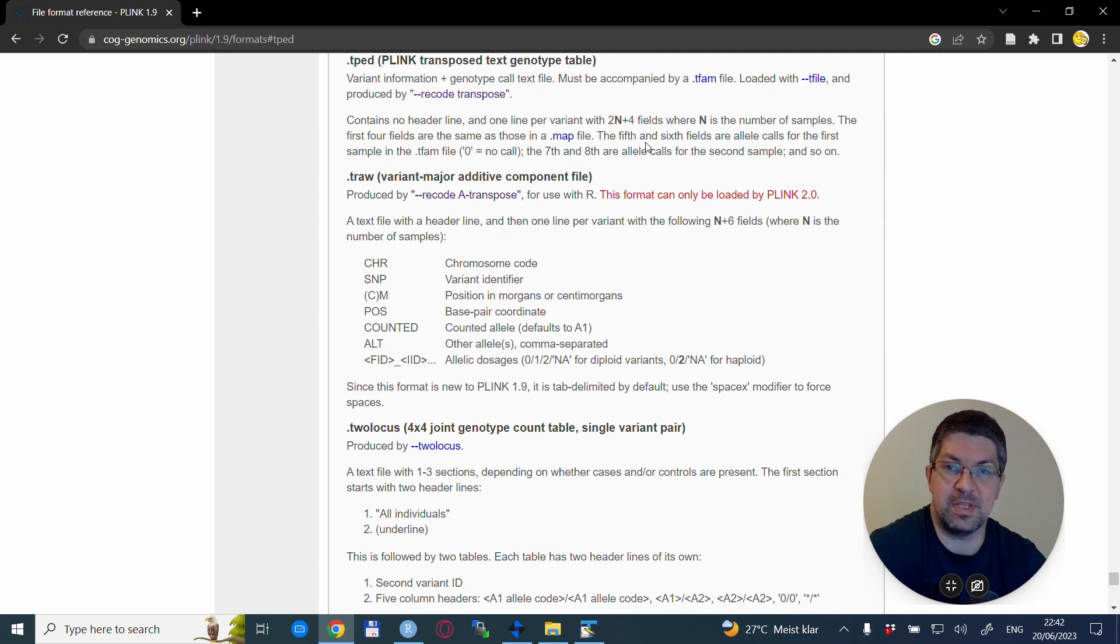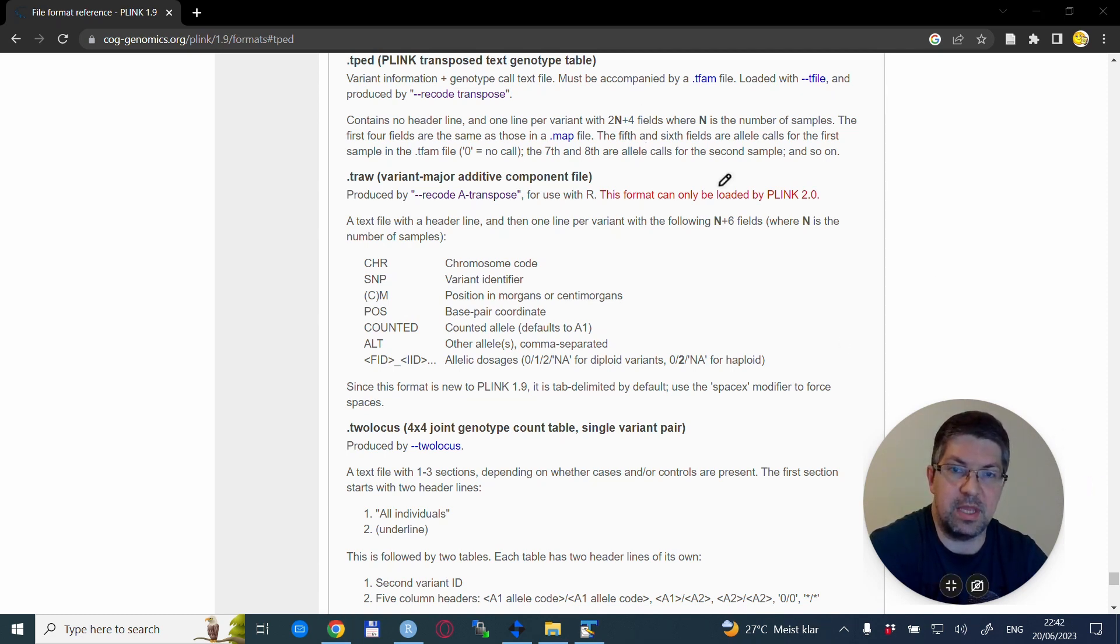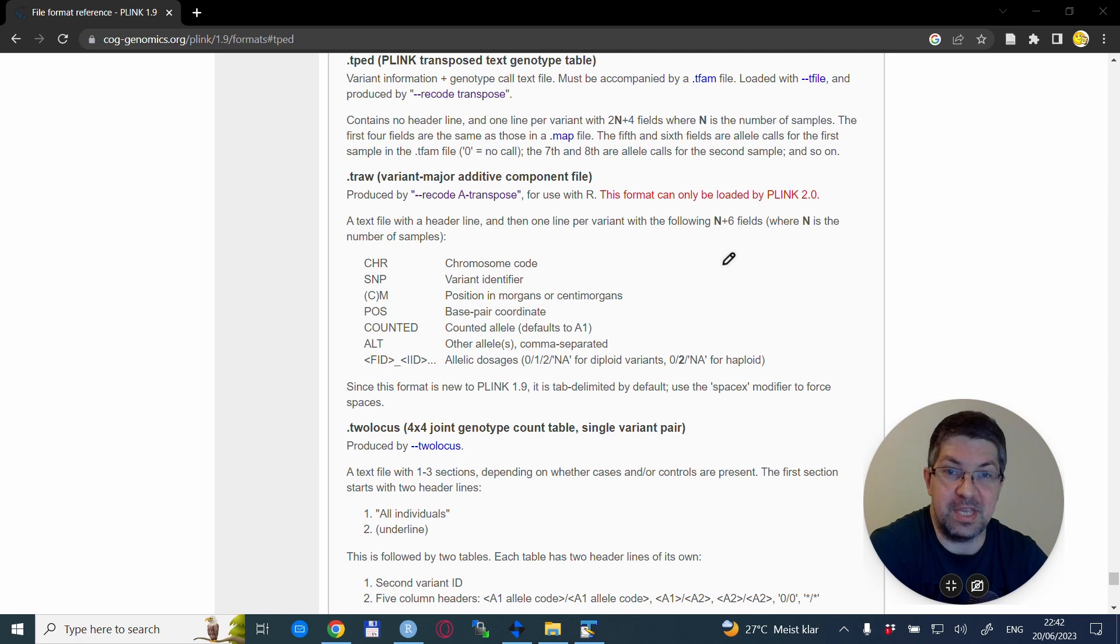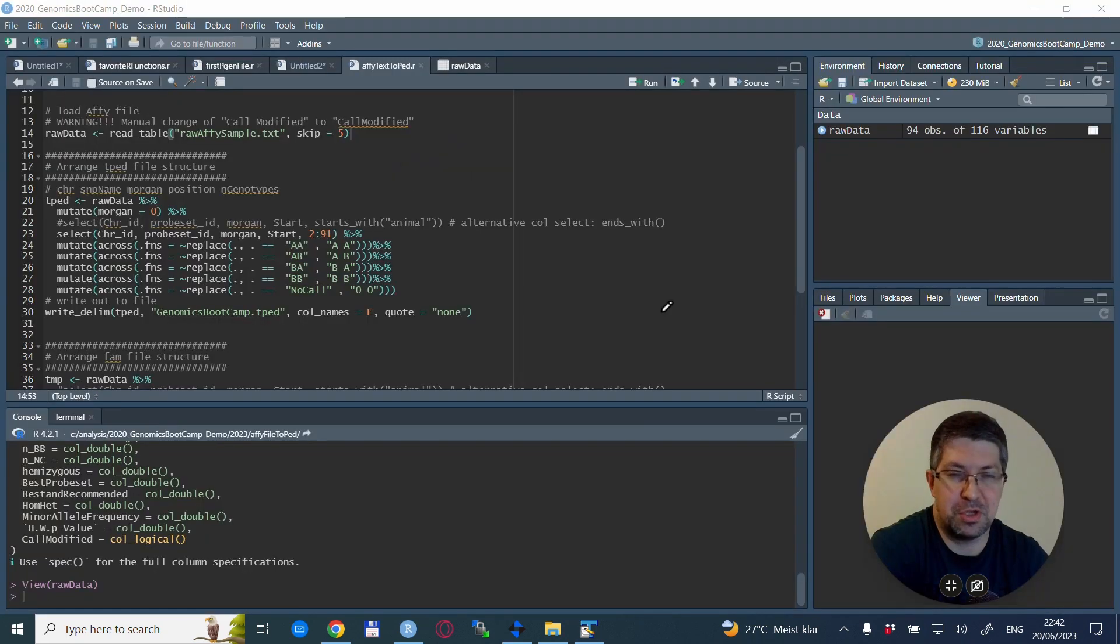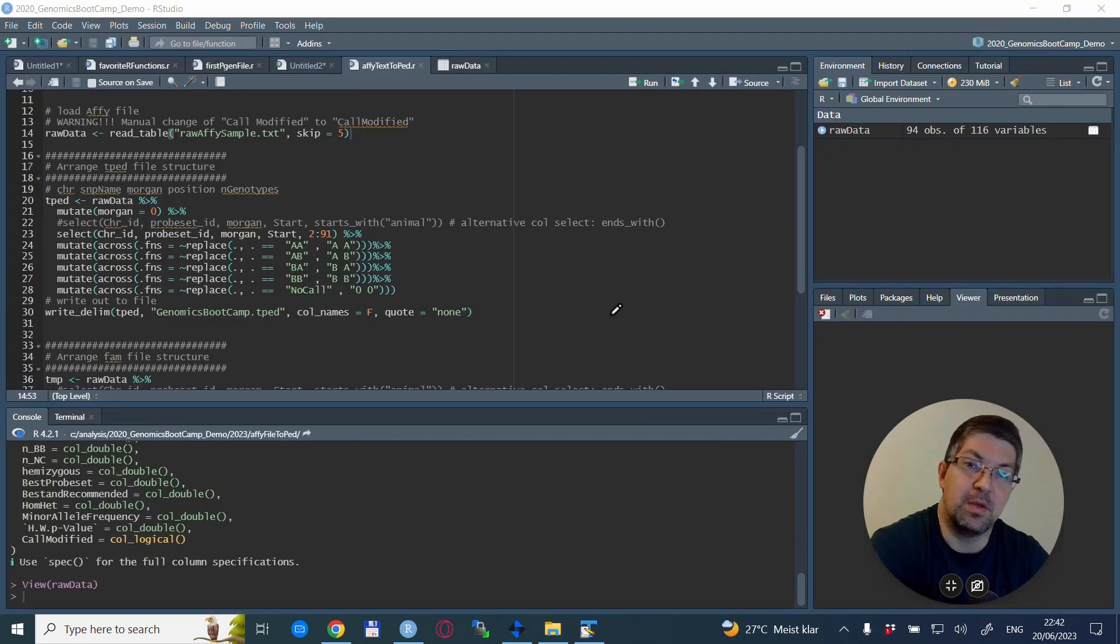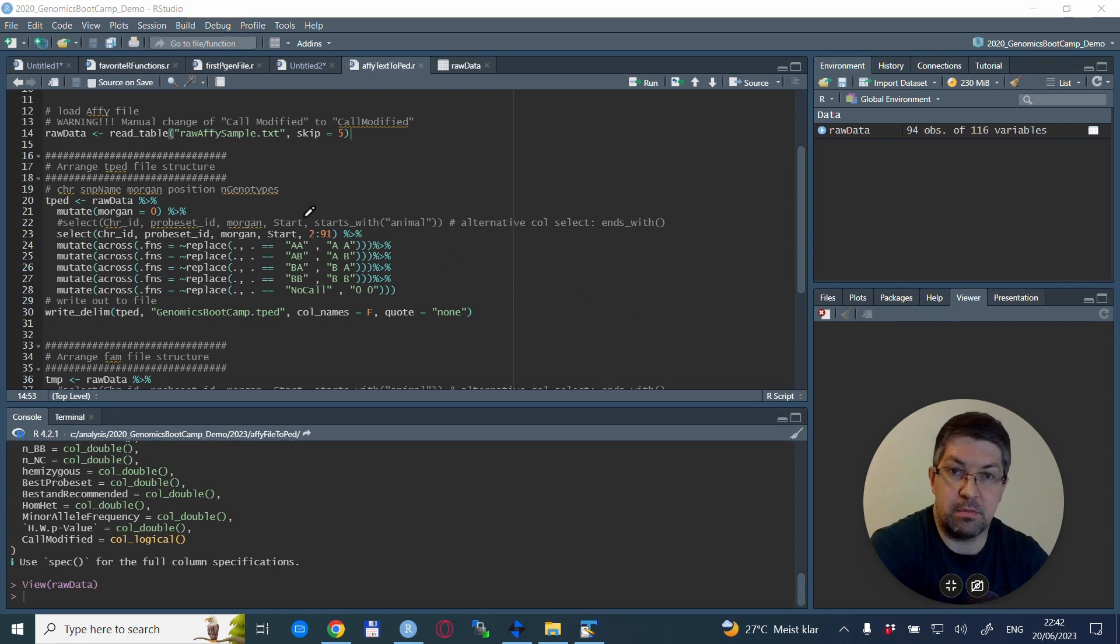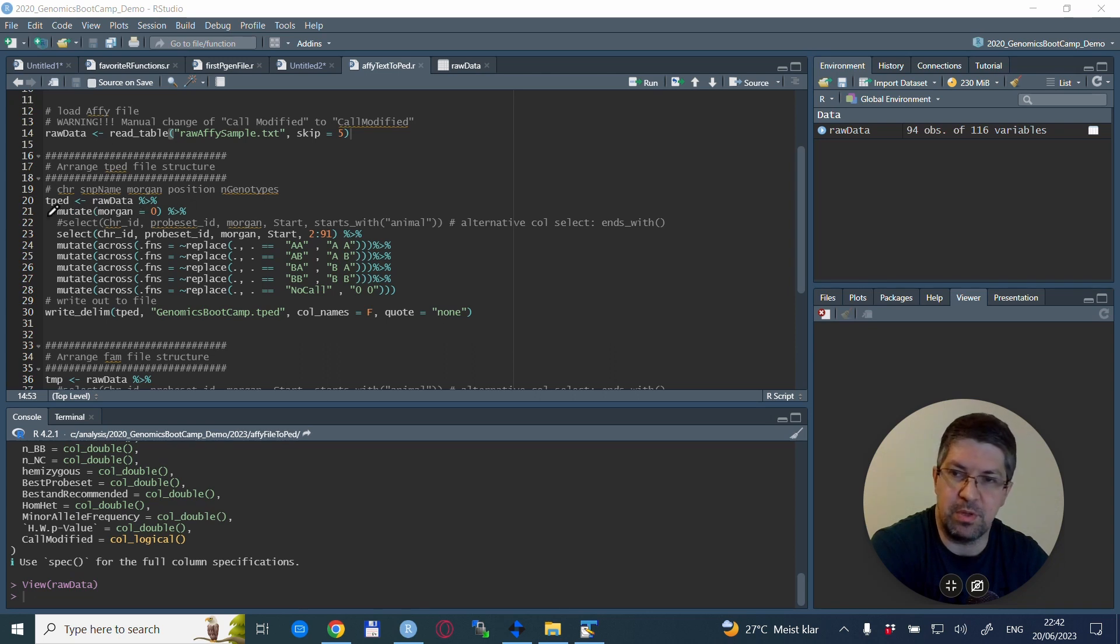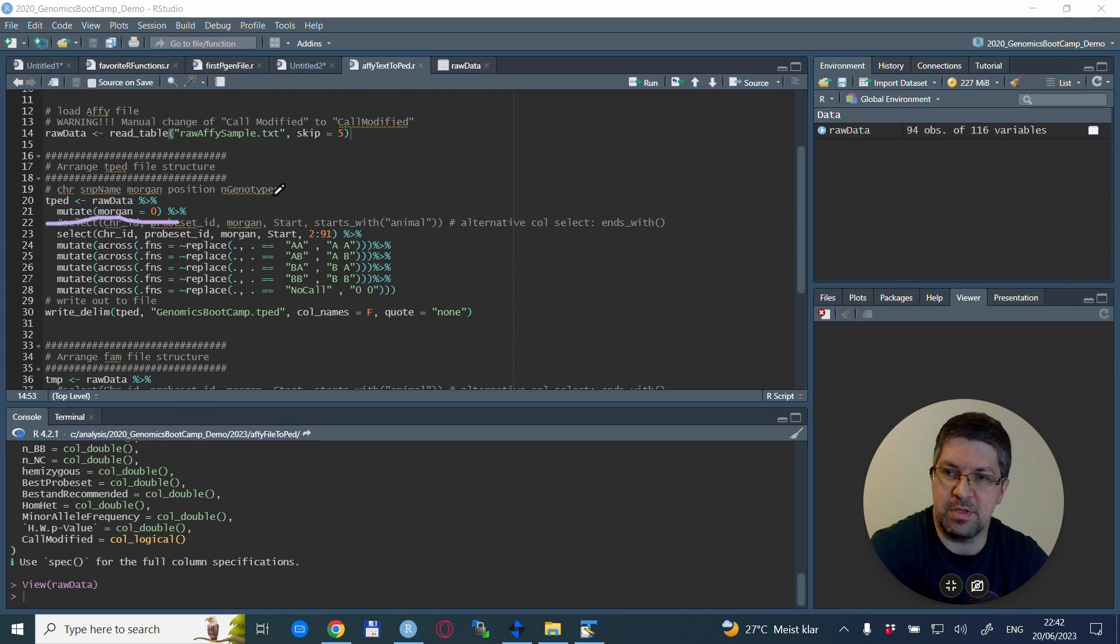If you check the tped file on the plink webpage, it has this short description that basically what it needs is 2n plus 4 fields, where these four fields are actually the map file. And you might remember the map file has exactly four columns.